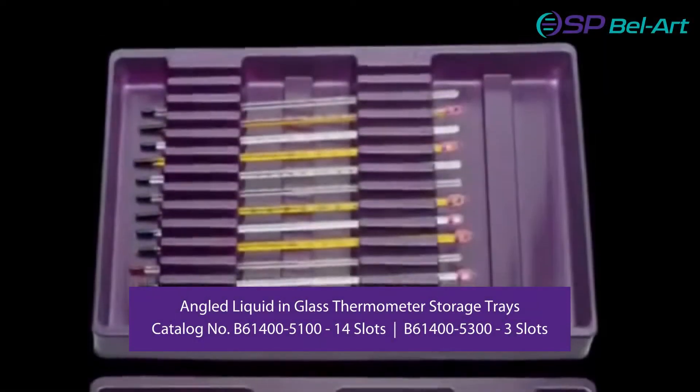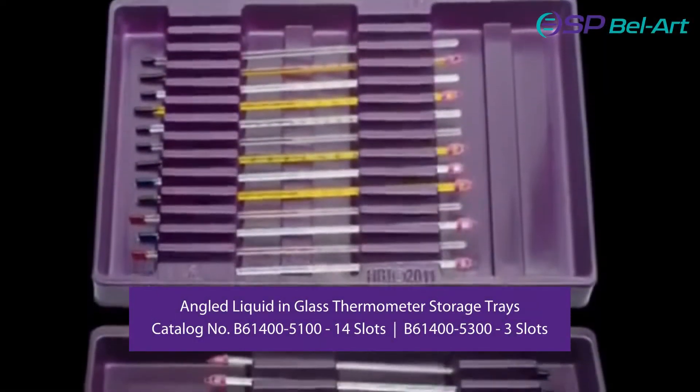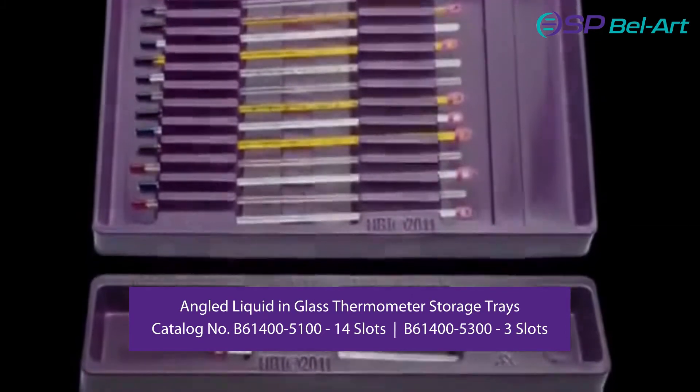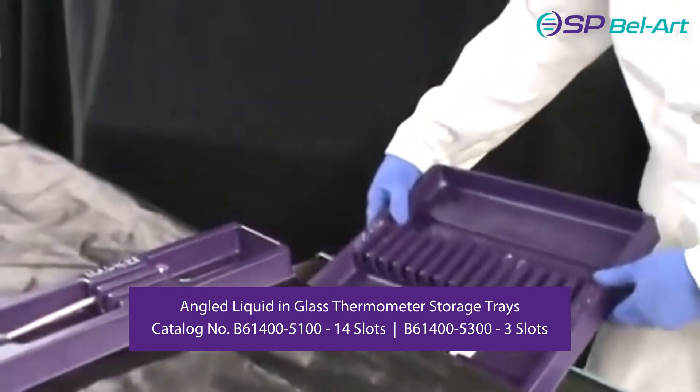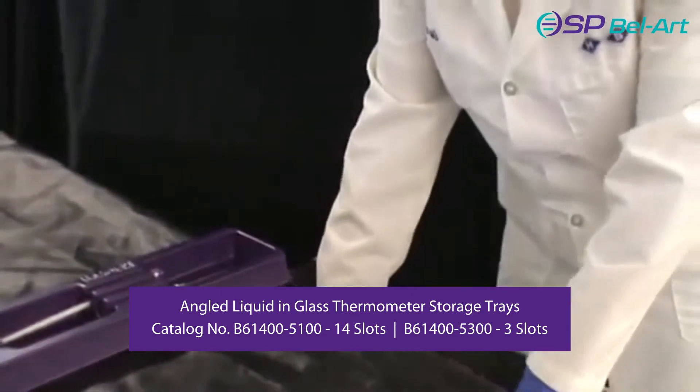We offer storage trays that properly store your thermometers at an angle to prevent liquid separation. These trays fit into a standard lab drawer.